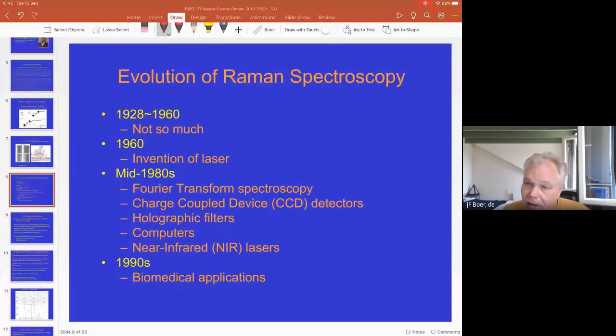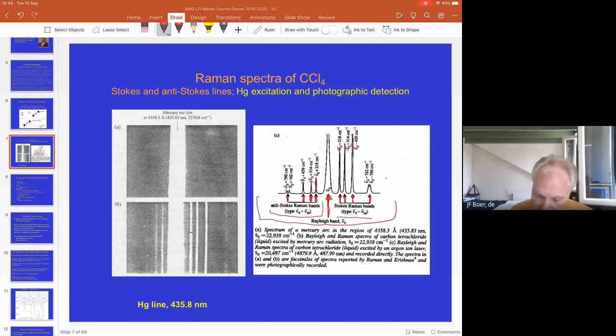But also it was realized that you could look at the Raman spectra of biomolecules, and that started the field of biomedical applications. As we will see later, these vibrational levels in a molecule are very specific and are very narrow. So if you look at these emission lines that we see here, they're very narrow. And that is a nice feature because it makes them very distinct from a background or a very broad fluorescence that is emitted. It allows you to characterize a molecule by what we call its fingerprint. It's a very detailed graph of its vibrational levels.